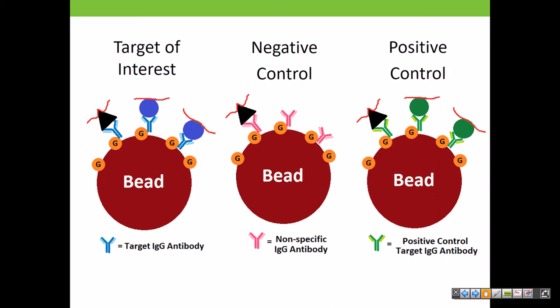And then, of course, the positive control, and this is true for any experiment. For your positive control, you want to select something that is going to have the best chance of succeeding. You don't want to pick a challenge as your positive control. You want the guarantee that even if you don't know what you're doing, it's probably going to work. That's the purpose of the positive control. That can tell you that your experimental technique is solid.